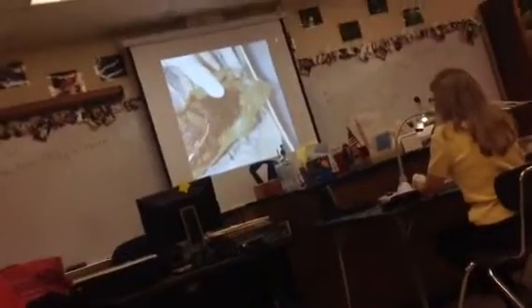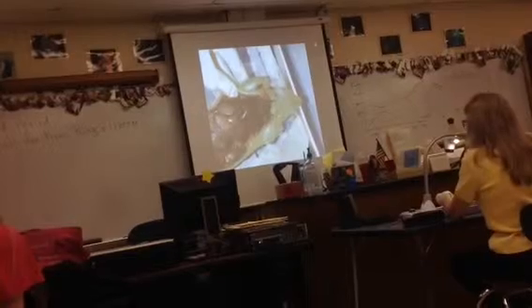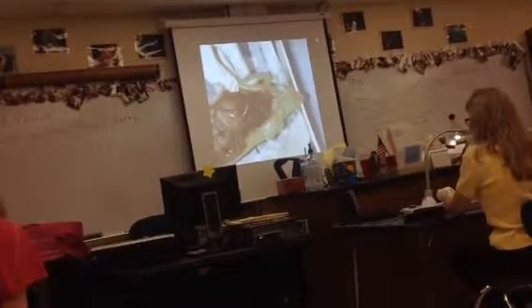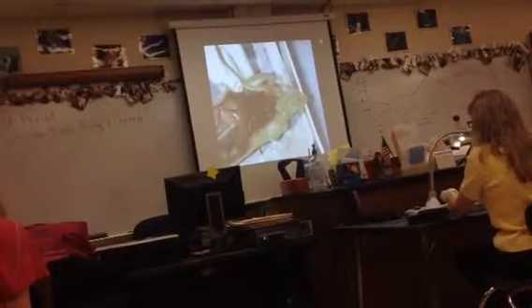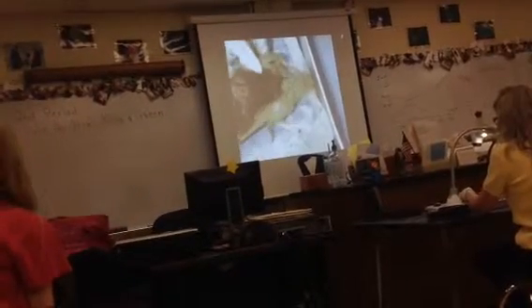What is this? What is that? Diaphragm. Oh, what is this thing? Heart. What's this little flap up here on the heart? It's hard to see. They're beside the heart. Kind of pointed. Goes like that. Is it a lung? It is a lung. Very good.